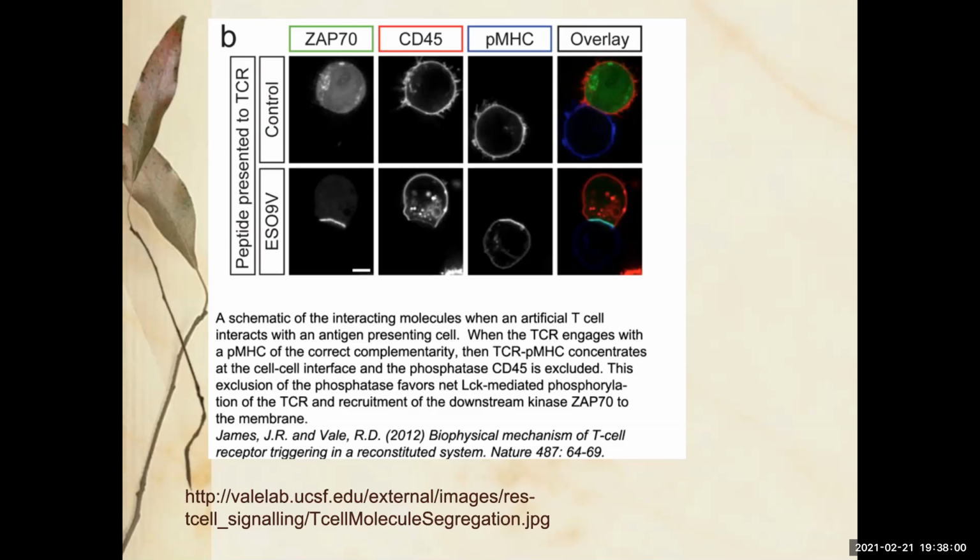So the red channel, the green channel, let's see, this is probably the green channel, red channel, blue channel. And because they know how to do microscopy, they actually took those images with a black and white camera, because a black and white camera is more sensitive.